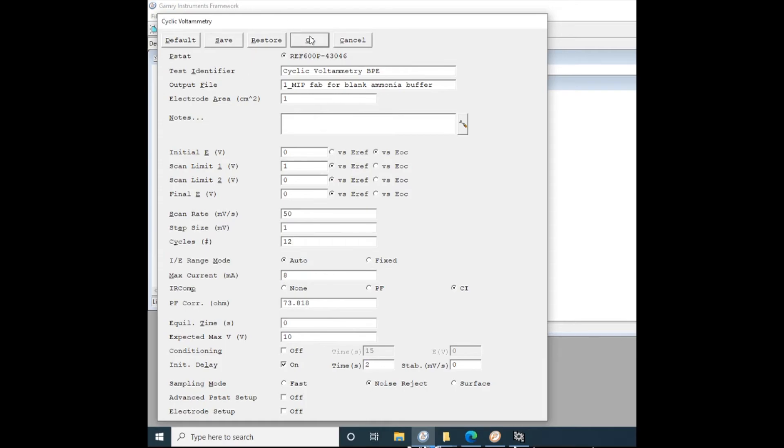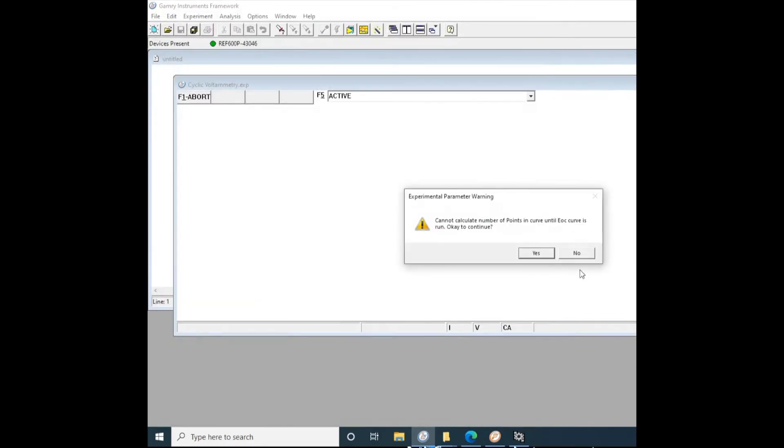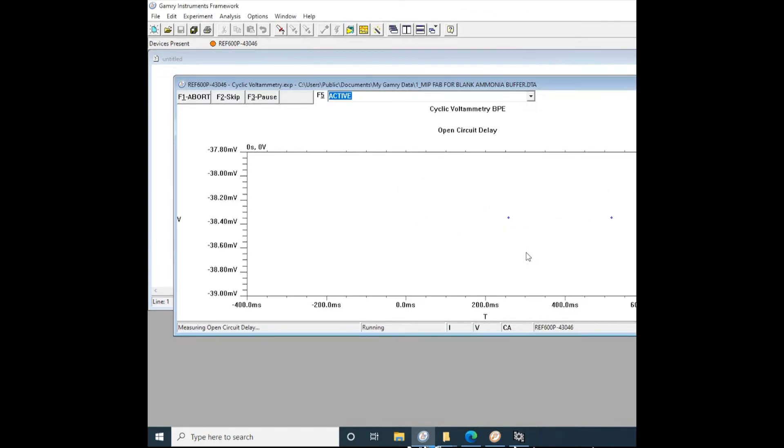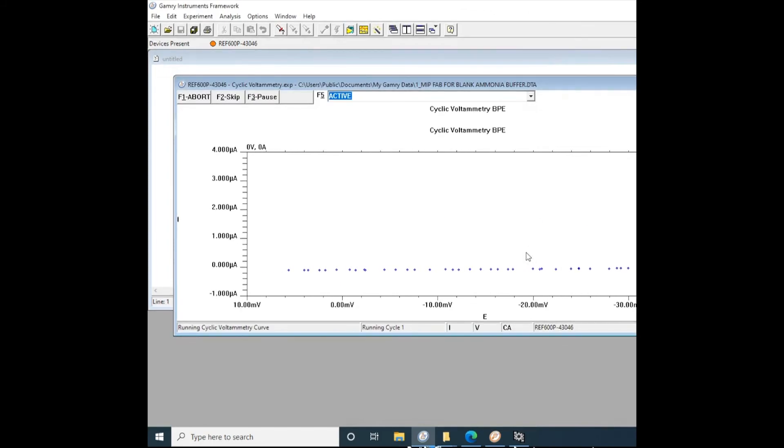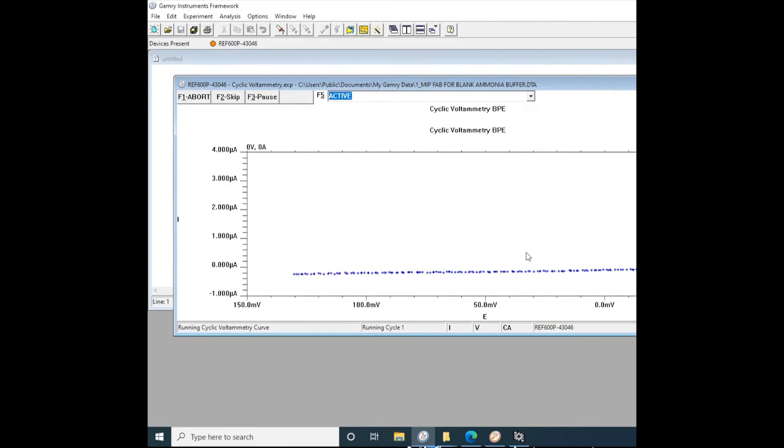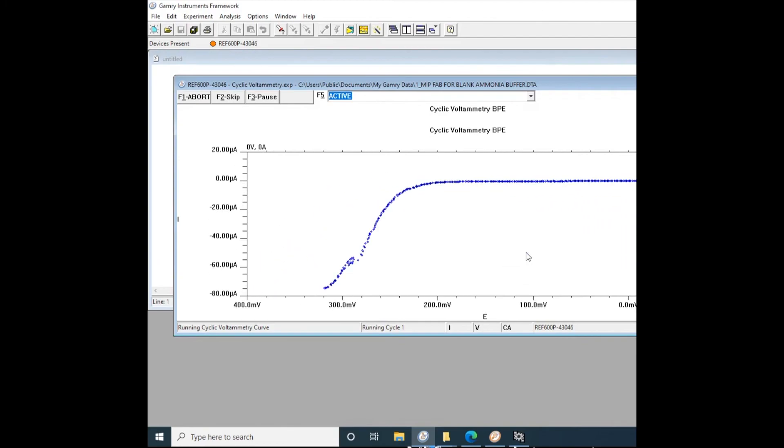Set our two-second lead time, and then this pop-up just tells you that it's going to use the open circuit potential to start from. You can make sure your graph looks good. And if there are no overflow errors, then you're probably good to go. That's all for today.